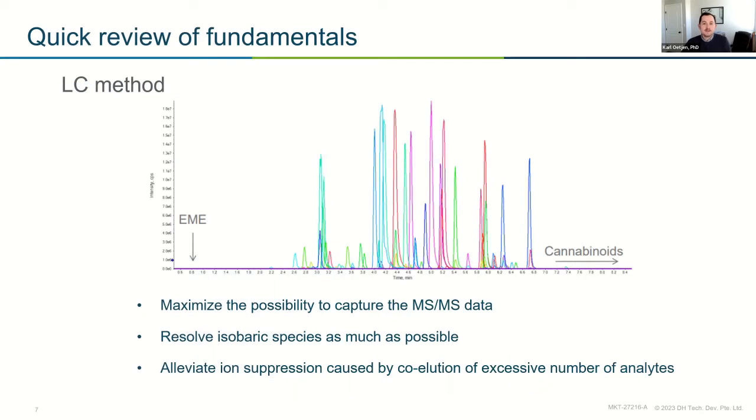And finally, like I mentioned, the polls are great feedback. A lot of folks asked last time, Simon, some questions about LC method development. Again, if you haven't checked out the nominal mass course, we go into a lot of detail about different parameters for LC development, what column chemistries you should choose, all of that good stuff there.